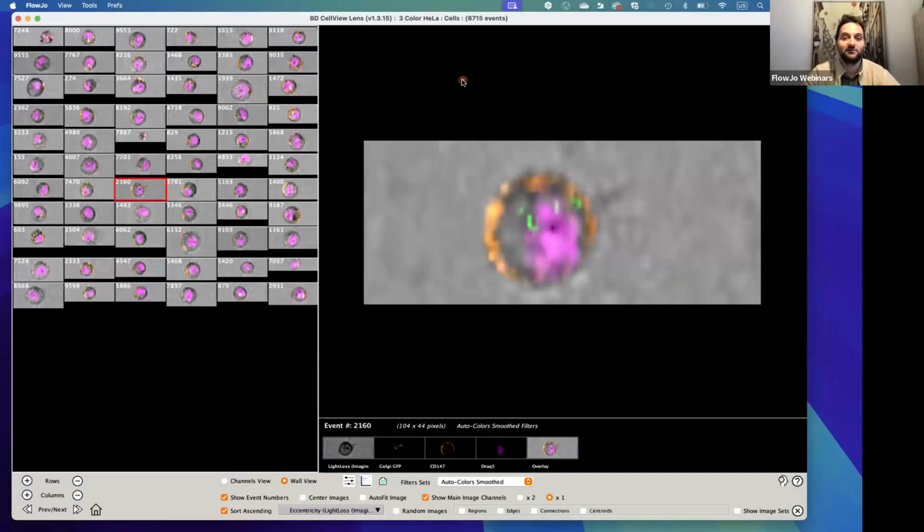I cannot answer that, unfortunately, because we see now data coming from phytoplankton to cancer samples, infection with tuberculosis. There are so many experiments that I really cannot. I expect that different samples would have different parameter importance. In our case here, for example, we're going to be looking at some cells with close interaction, so it might be that eccentricity plays the most role.